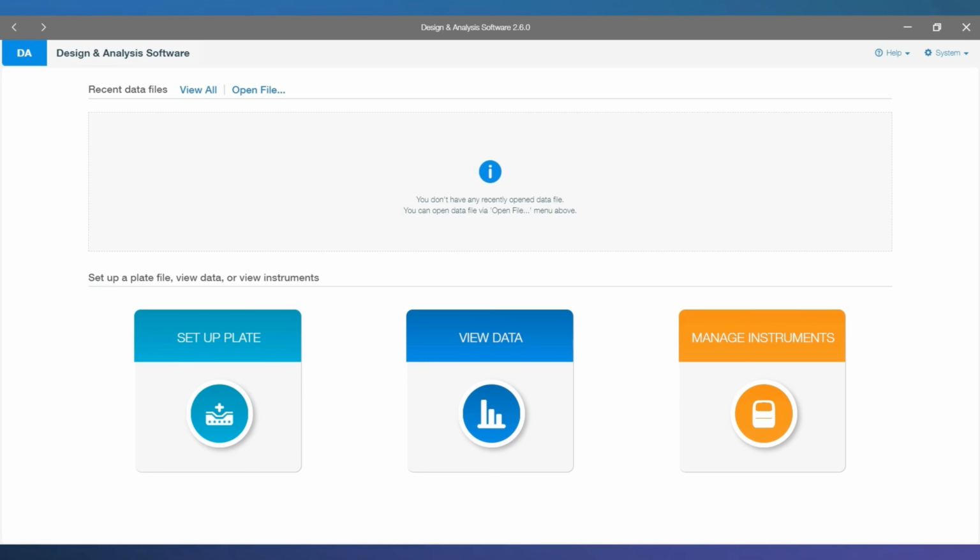To start, a quick word about the software itself. QuantStudio Design and Analysis Software is a desktop application that can be installed on a computer connected directly to the instrument or used as a standalone workstation. It's used both for setting up QPCR experiments and later on for analyzing the data once the run is complete. The same software is used across the QuantStudio QPCR instrument family.